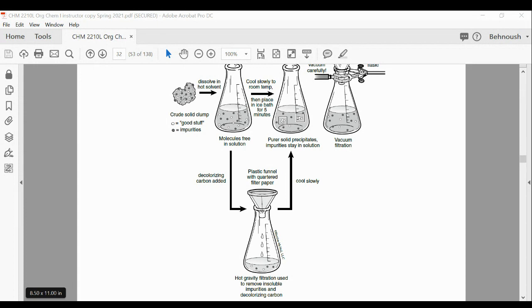Lower the volume. You can't add more compound because it was a product of the reaction. So you cannot add more of the compound, because you didn't start from, like, 1 gram in a container. It was a chemical reaction. So how would you lower the volume? Pour some out? That's not going to work, right?